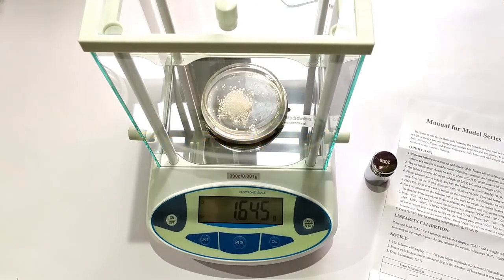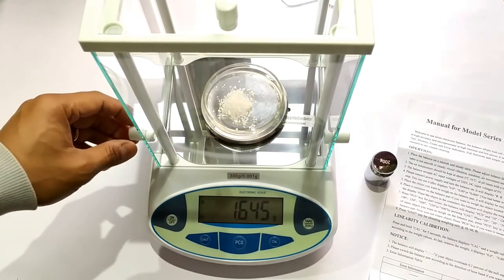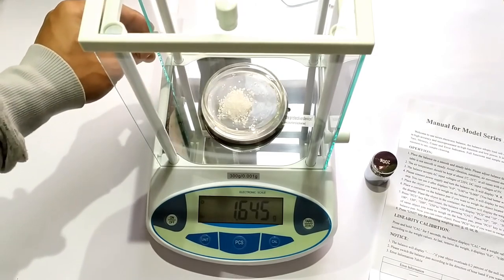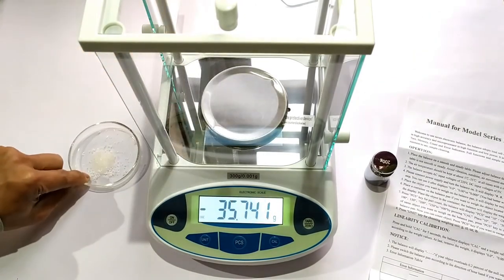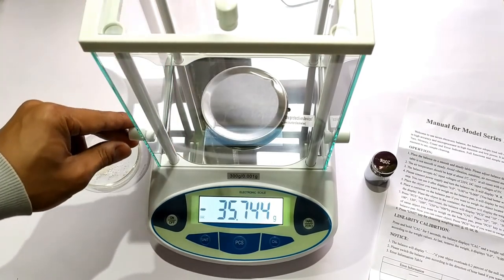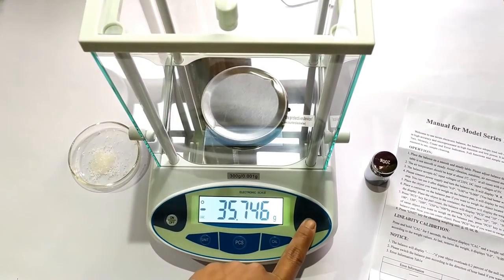Okay that's quite impressive. We now remove the petri dish. However much value is displayed on the negative side is the approximate weight of the empty petri dish. We set the device back to zero by pressing the tare button. And again the buttons are annoyingly quite unresponsive.